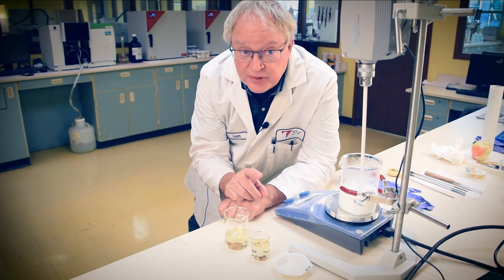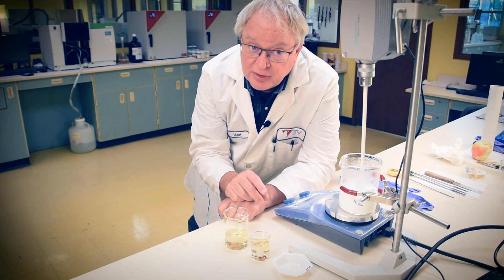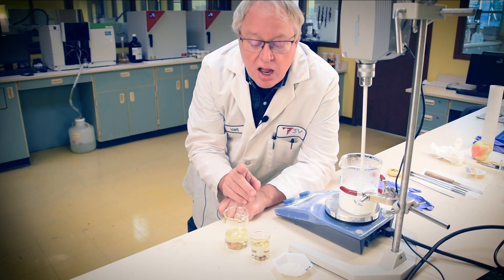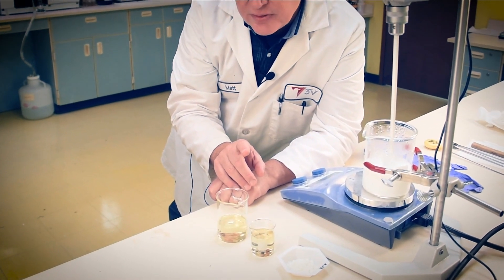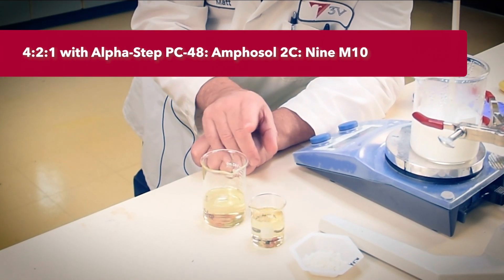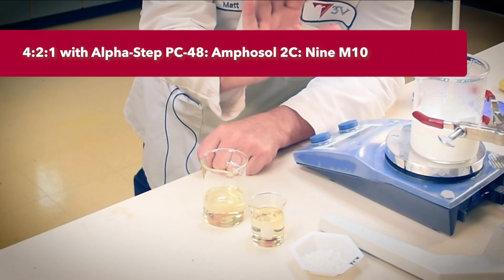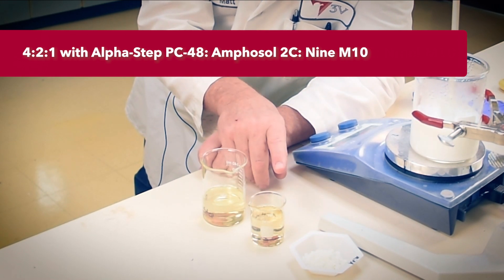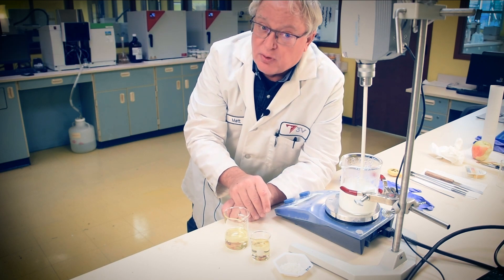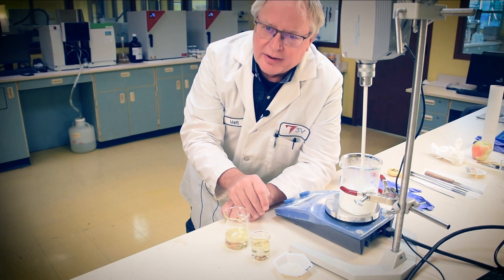In this body wash formula, we'll feature three surfactants from Stepin — none of them sulfates, so as to soothe the clean beauty aficionados. I've ordered concentrations to reflect the classic approach of using a solids ratio of 4 to 2 to 1 respectively of anionic to amphoteric to alkyl amide builder. Thousands of cleanser formulations have used that ratio for many decades.